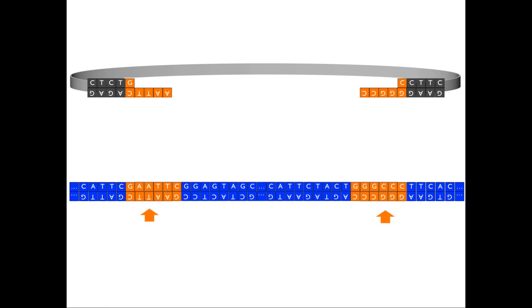When this happens, restriction enzyme recognition sequences will be present between the two fragments. These are known as assembly scars.